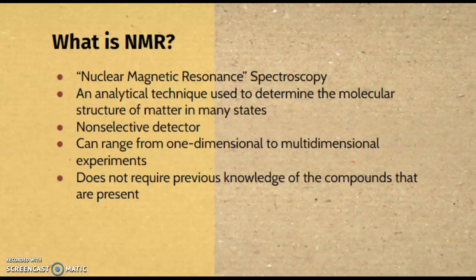First, I'd like to talk more about what NMR is exactly. You guys are probably familiar with it by now since we've been doing it for the past 2 semesters or something, but I will explain it anyways. It basically stands for Nuclear Magnetic Resonance Spectroscopy, and it's an analytical technique that is used to determine the molecular structure of matter in many states. These states can include solids, solutions, or gels, just to name a few.